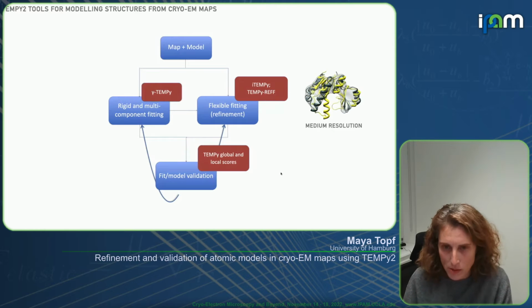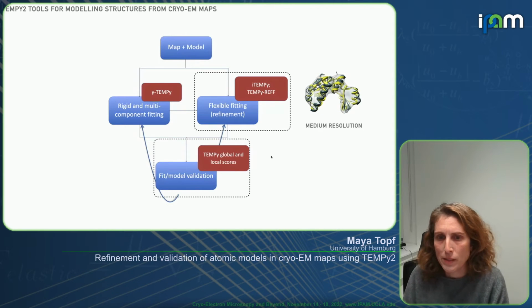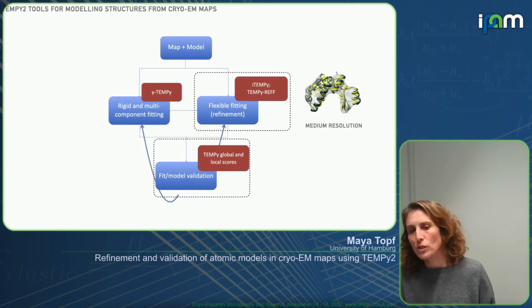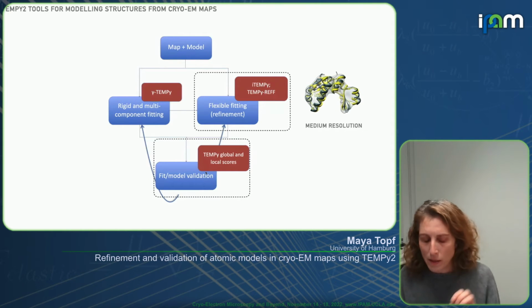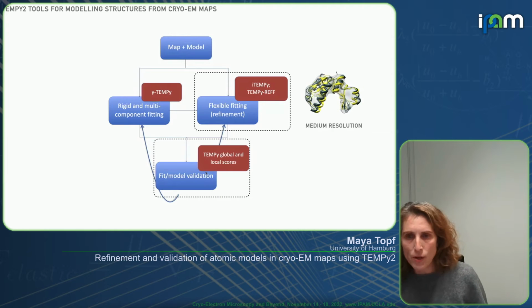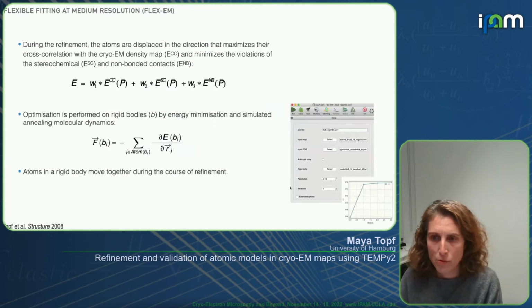So what do we do in this situation? We have two methods I will talk about. What I'm going to show you is that we interactively refine the structure and also look at those scores that I was discussing before.